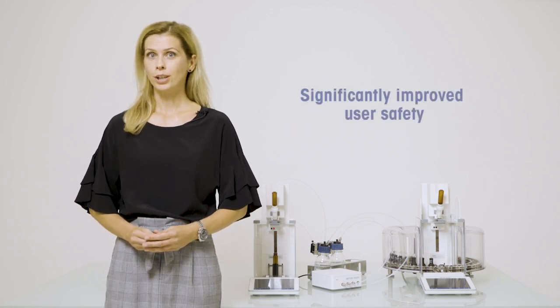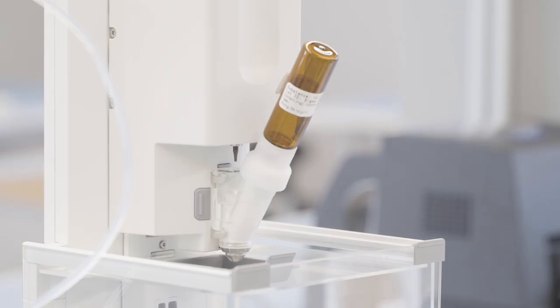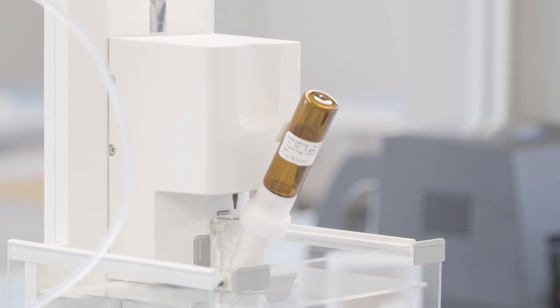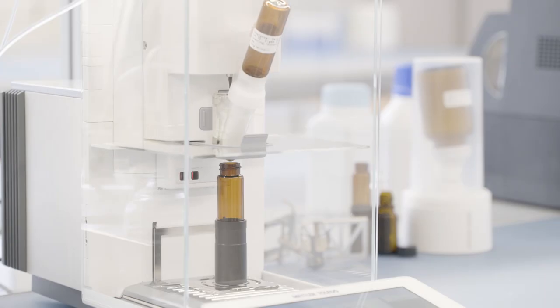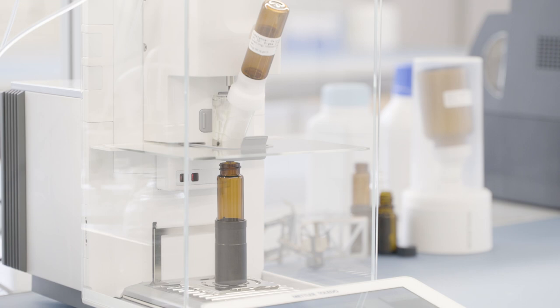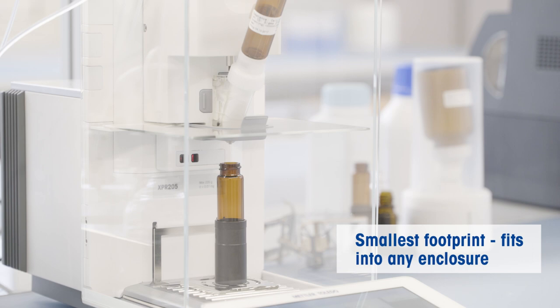Improved user safety is an important advantage of the XPR Automatic Balance. The sample is closed in the dosing head and dispensed directly into the target container, minimizing the operator's exposure to toxic or chemically aggressive substances. Moreover, automated dispensing eliminates the risk of spillage. If necessary, the whole system can be easily placed inside a safety cabinet or glovebox thanks to its extremely small footprint.